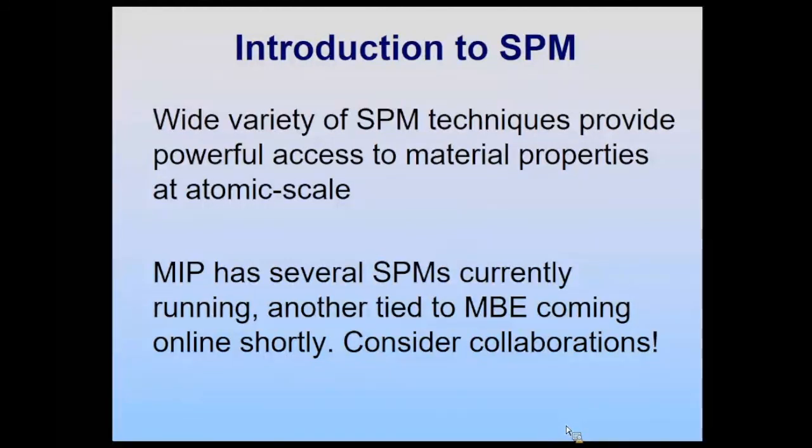We have another question online. Does the surface roughness interfere with the contact potential measured in KPFM? It absolutely can. So you need to be very careful about that as you make the measurement. You have to work at a force setting, basically, in non-contact mode, which lifts you up enough that you're not making huge variations in the height as you're doing the KPFM measurement.